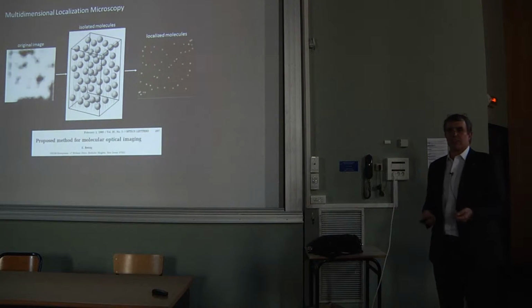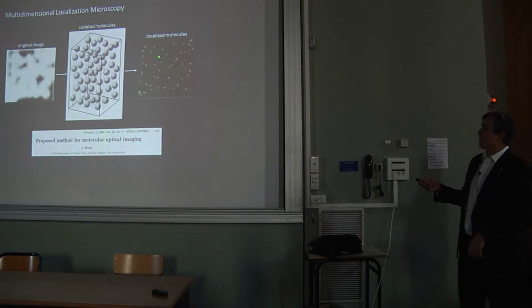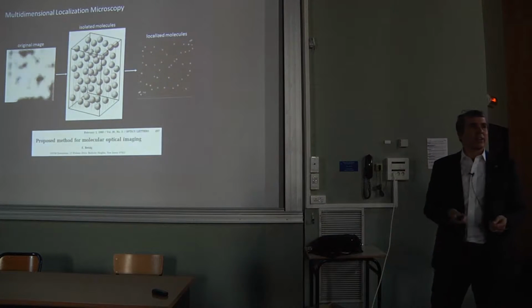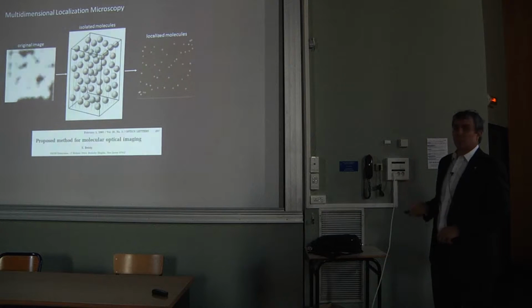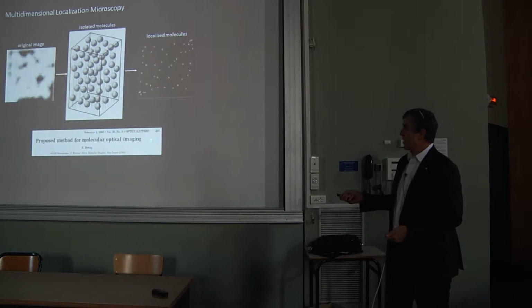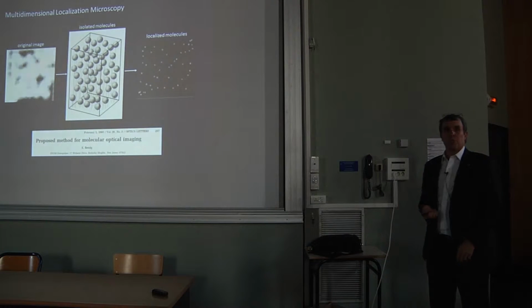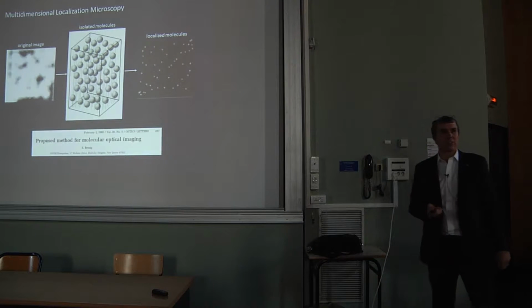And the more photons you get, the higher the precision of your estimate of where the center is. And so it's fairly easy with a few hundred photons to get sub 10 nanometer precision. And then if we could do that with every molecule, if they were sufficiently isolated, we would just have a molecular resolution map of the sample. So that was an idea I pitched after I left Bell. I got that idea while I was pushing my daughter in a stroller while I was unemployed, and then I just published that on my own.